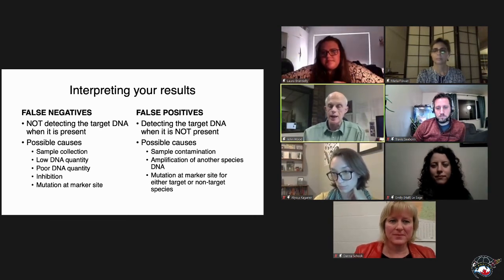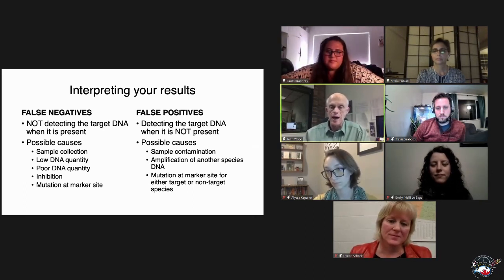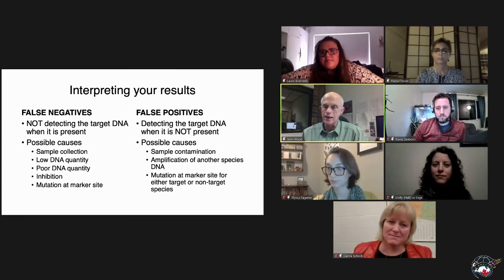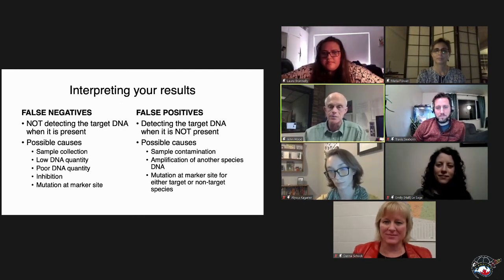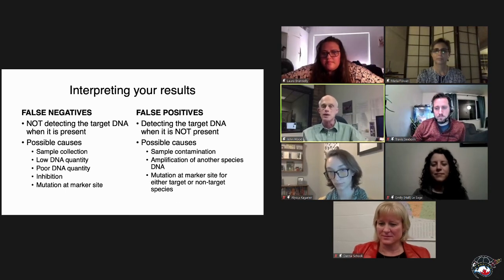Yeah, I guess I'll expand on that, Emily. A lot of the eDNA samples we get positives, and we report copy numbers per sample. And inevitably the question comes back, well, how many animals is that? I think it's important to realize that when you are doing eDNA testing, we're now talking about molecules, and that's what I'm measuring. I'm not measuring number of animals. And so the question doesn't make sense. And so as you're planning your study and what you're trying to prove or disprove or figure out, make sure that you're good with copy numbers per sample, not number of animals.